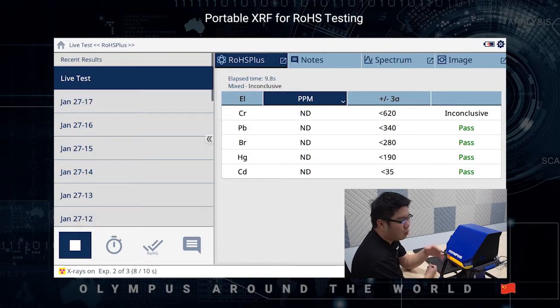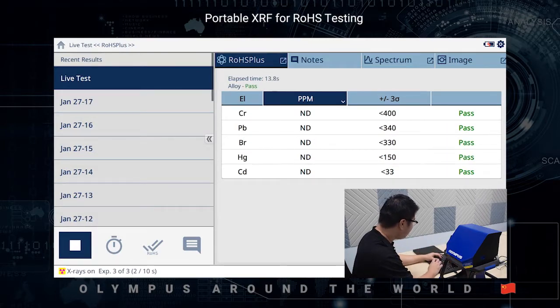Also, when X-ray is emitting, you will see a blinking light all around the workstation. In less than a minute, you will be able to get the results with the pass-fail analysis.